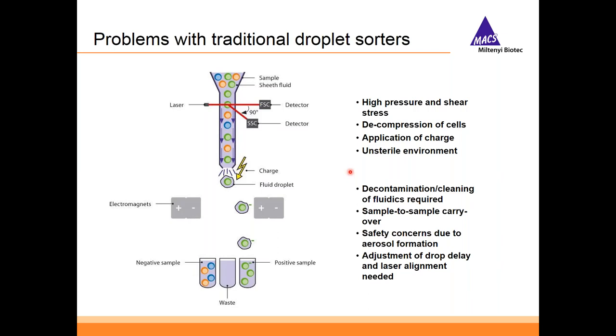As I said, safety concerns are also under discussion, as we actively generate droplets. And if you generate these droplets, including infectious material, such as bacteria or maybe also untested patient samples, this is, of course, a problem for the operator. In addition, these systems are very advanced, but you also need highly trained professionals to really work with them. These people really need to know what they're doing, as a lot of things need to be adjusted, such as drop delay or laser alignment.